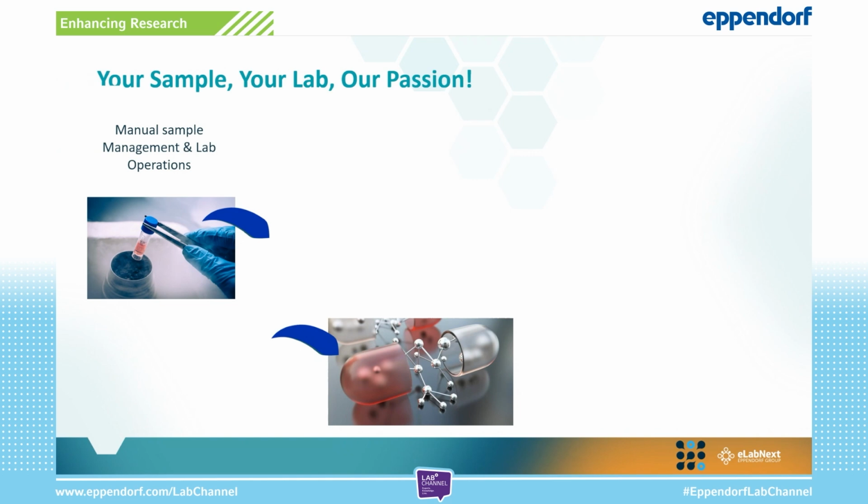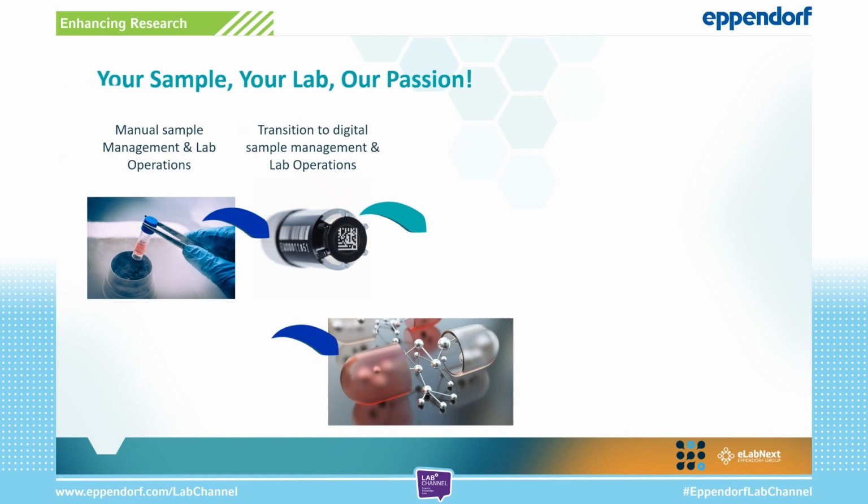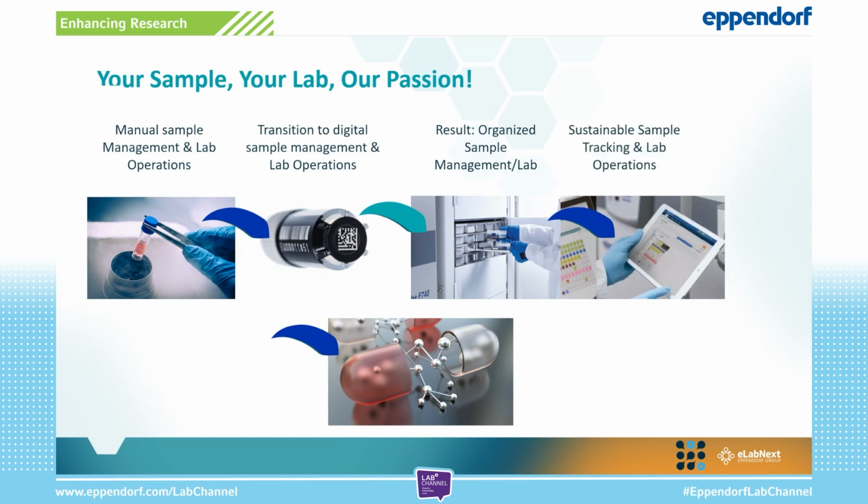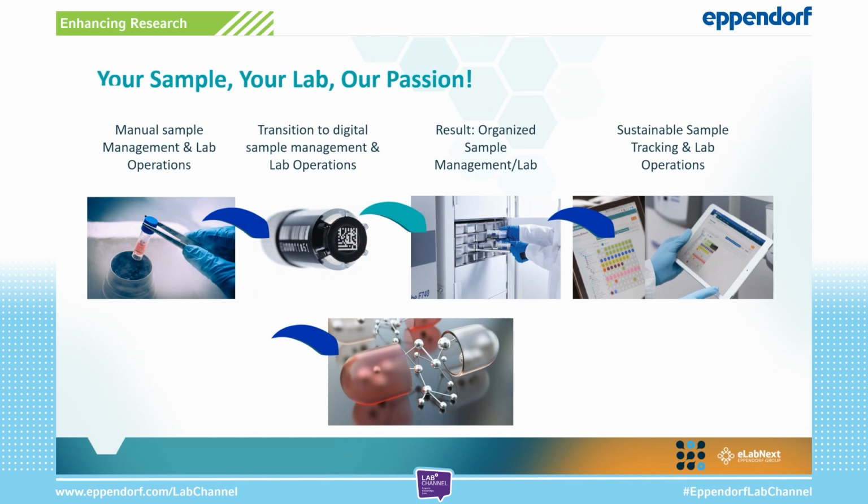So this path towards drug discovery all starts from this transition from manual sample management and lab operations to digital sample management and lab operations. This could be done through a simple means like getting the safe code tubes, tubes that are already barcoded, collecting the data and the metadata associated with these samples, all the way to collecting all of the instrumentation data that you get from analyzing these samples. And this brings us to more organized sample management and overall organized lab operations, which then essentially brings us to sustainable sample tracking and lab operations.